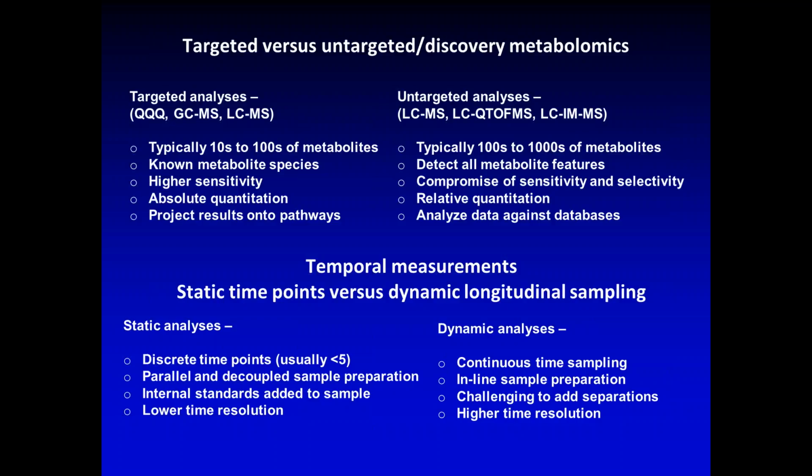By and large, a lot of the research that we do in an untargeted discovery mode is usually done using things like quadrupole TOFs or quadrupole ion mobility TOFs, usually with some amount of selectivity up front, for example, with liquid chromatography. In those types of analyses, we're giving up some amount of sensitivity so that we can get broad-scale selectivity and try to characterize all of the different features that are there. Now, I'll focus the end of the discussion more on that type of analysis, but specifically on how we filter through the information to discern which are the important metabolites for the question at hand.